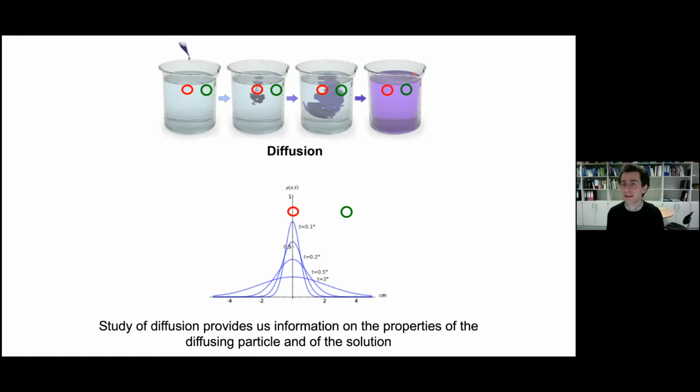So on average, everything still looks homogeneous, but there is still diffusion, so molecules moving around. So the question is, this will be what happens in the cell at equilibrium. So can I recover information on diffusion in a fluorescence microscope when I look at this situation? This situation will be easy, but this situation, you cannot just force the cell to pack all the actin in one corner and then say, now you're free to go spread throughout the cell, I see how fast you go. So we are always looking at this situation. So can I recover this information here?